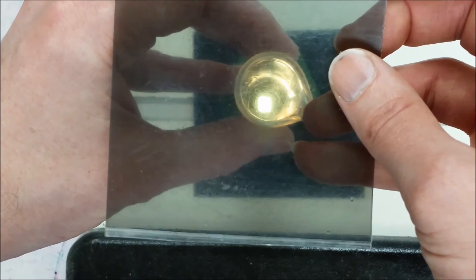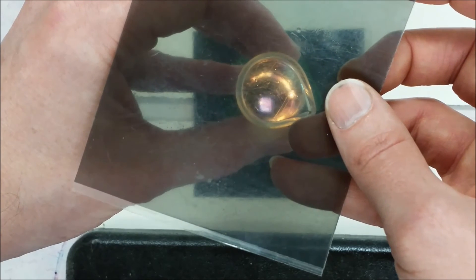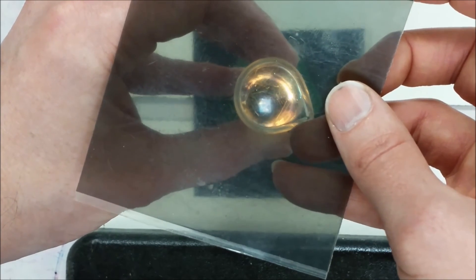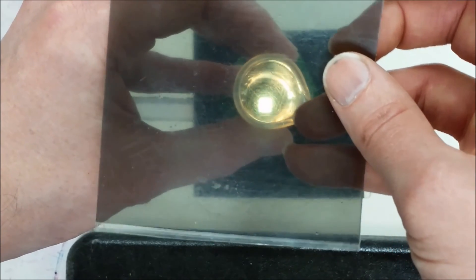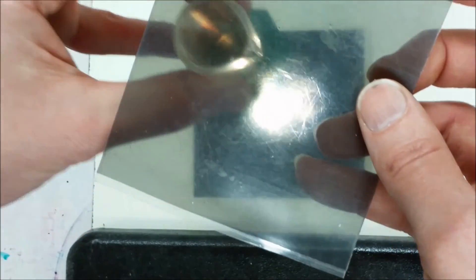So you can see that here is where there are 90 degrees, and then when I rotate this, it becomes darker. And so we're looking at an angle now where the plane of polarization has been rotated from before. And so now this angle we can measure.